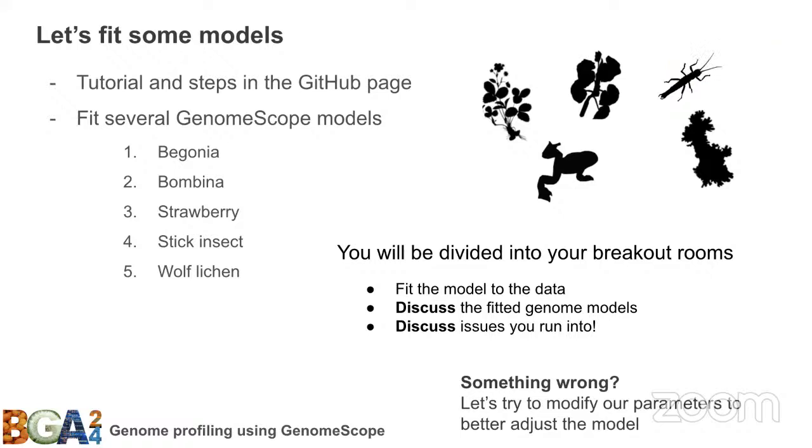Yeah, so I fitted it in an undergraduate practical where they sequenced bacteria. The sequencing was very short, so the k-mer plot was a bit weird because the sequences were way shorter than expected. Excellent.